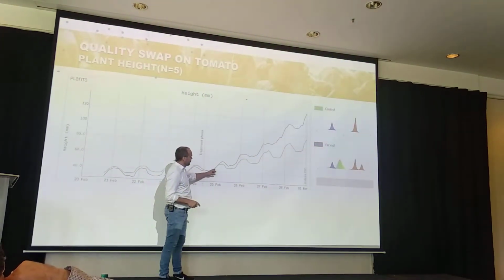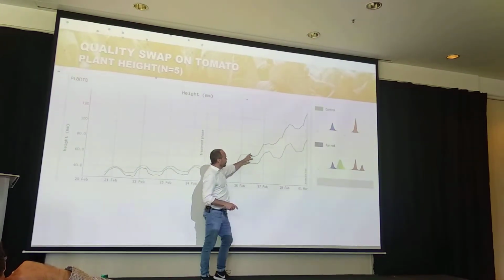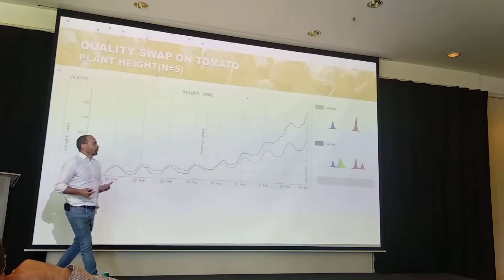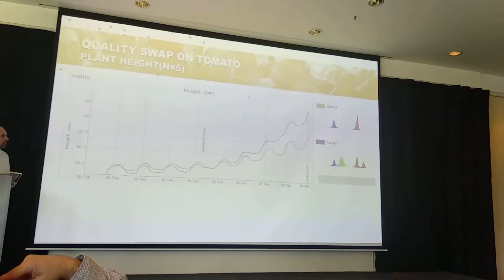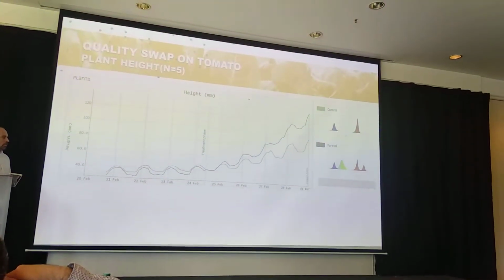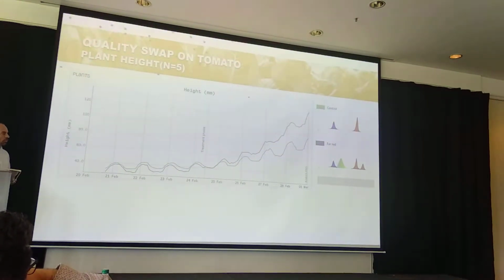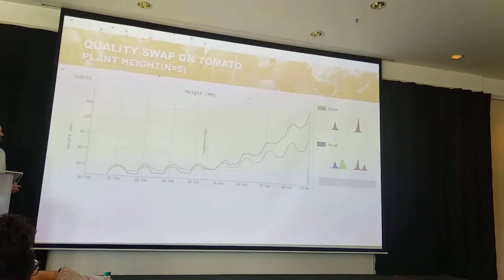And we continued to measure, and you see there's a reaction after 24 hours. You can see the plants treated with far red grow quicker, elongation. So that's cool, there's something happening. The reaction is quite fast. So we're quite happy that we change the light composition, and almost in real time you can see the reaction on plants. So that was the first experiment we did.